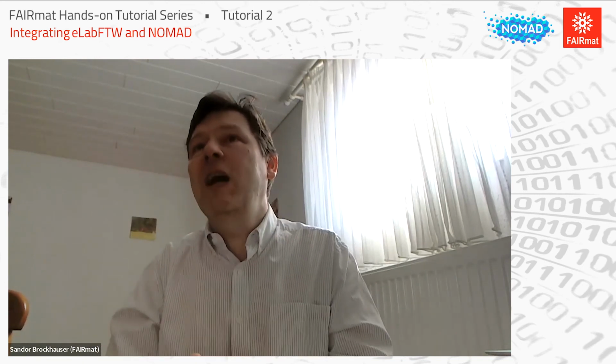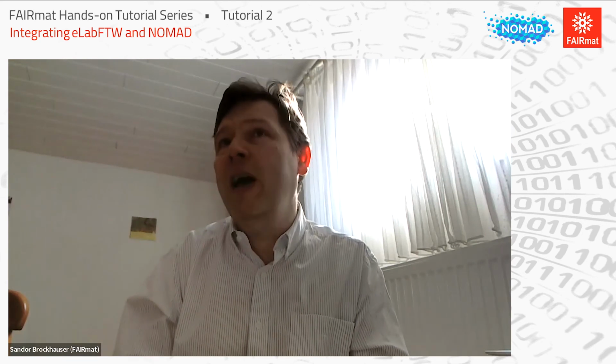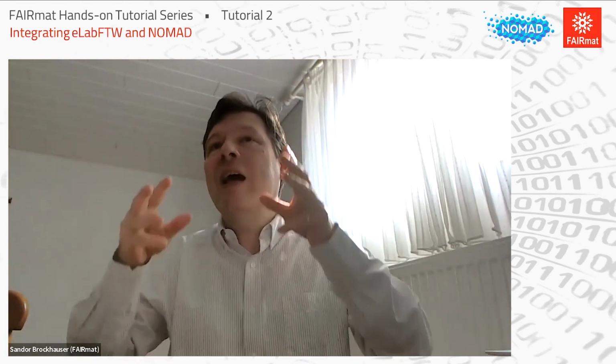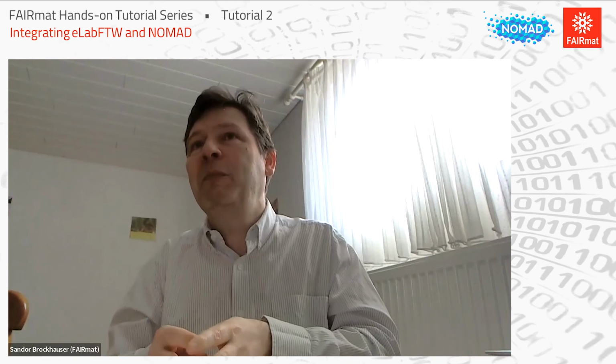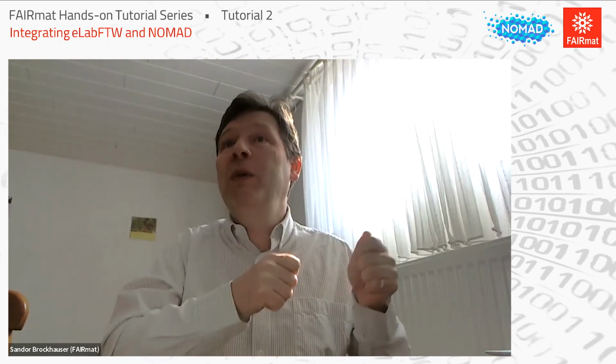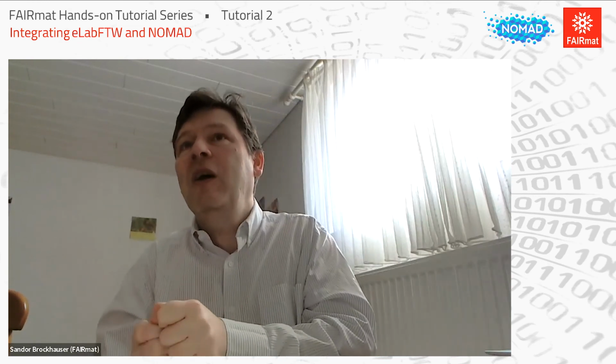And as soon as you've got this, then you are already one step closer to having something FAIR, which is findable. At least now it can also be accessible. To be interoperable and reusable, you really have to define what they are. So it's not enough just to give a schema and that's it. You really have to define what is in the schema, because that's how people can then interpret it, and that's how people can then write code, so it becomes actually machine interpretable afterwards.